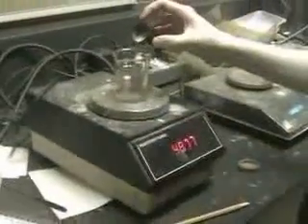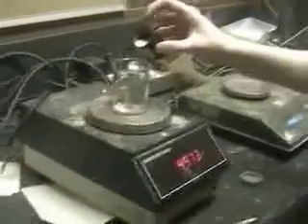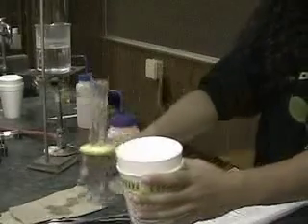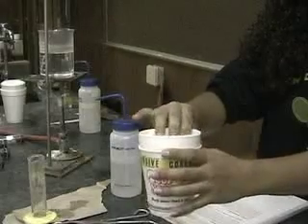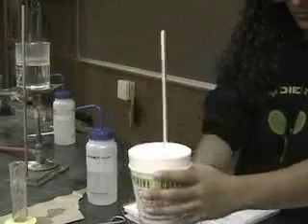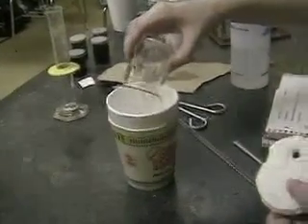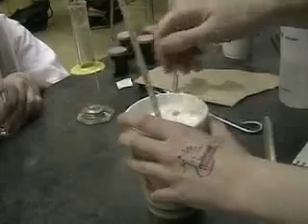To find the heat of solution, or the heat released when something dissolves, we must find the mass of the substance we're going to dissolve. We will then put it into the water and measure how much heat is absorbed by the water. Once again, we must know the mass of the water that is in the calorimeter, and we must also know its initial temperature. We then add the substance to the water. Be sure that all of the substance dissolves.